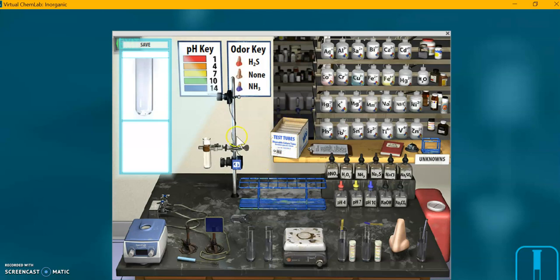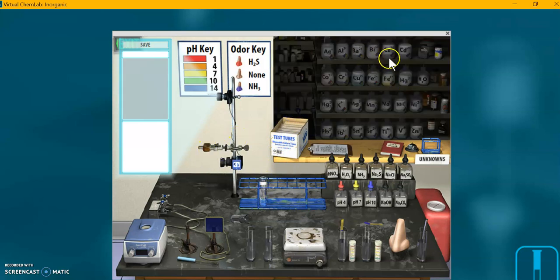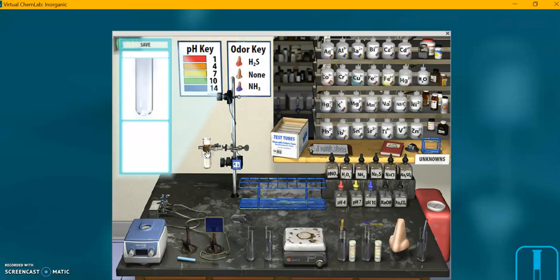I'm going to notice that if I put this in the rack, these things are darkened. You can't activate them. It needs to be in the stand for you to really do anything.